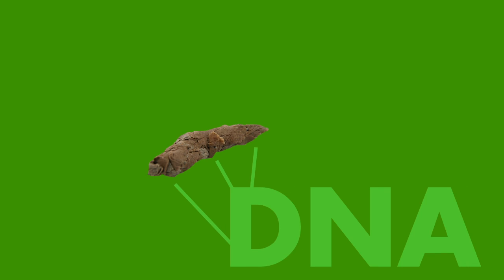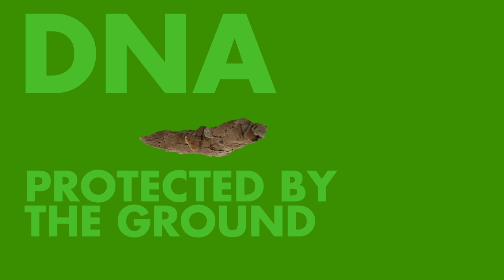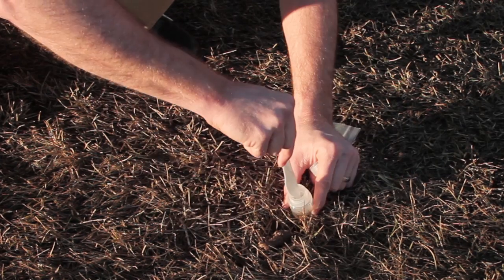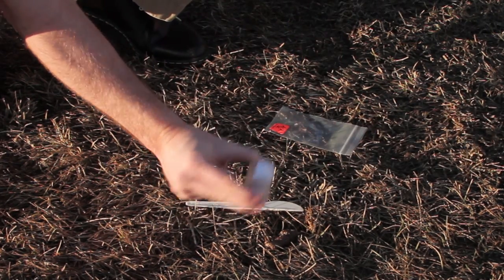Next, it's time to get a sample. Dog DNA is most prevalent on the outside of the poo and on the ends. For best results, flip the poo over. The bottom part of the poo touching the grass is protected from the elements. Now cut a nickel-sized part, put it in the collection bottle, and shake away.